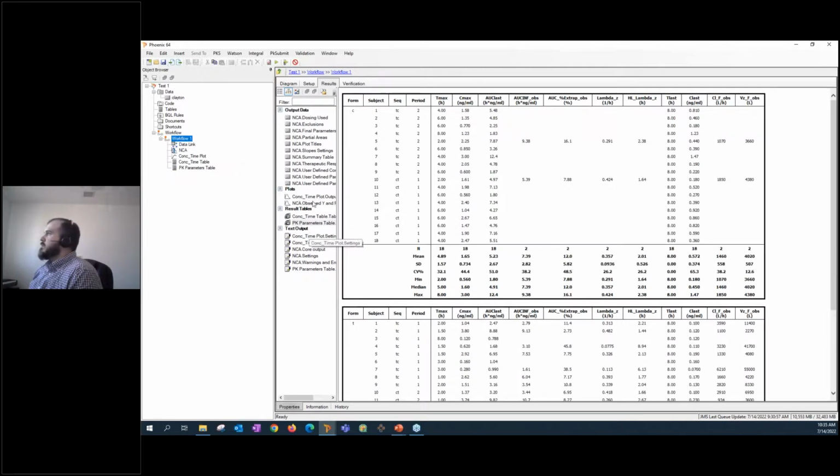And there you go. My analysis is updated, and I'll go ahead and save this back to Integral. Now, what you could also do is there's an option here called Save As. Save As would allow you to save this analysis as a separate analysis. It would start out as version 1, and you could give it a different name, whereas Save allows us to keep focusing on the main analysis that you're working on and incrementing those version numbers. So that's what I'm going to do right now.